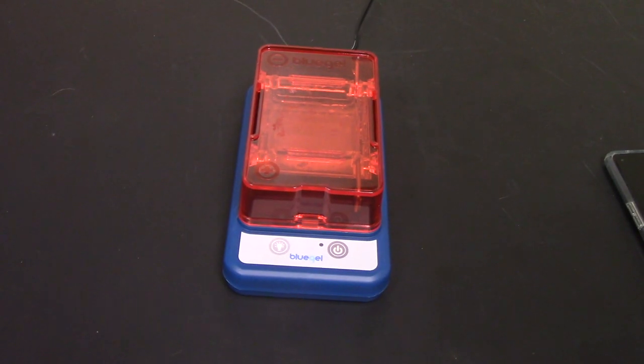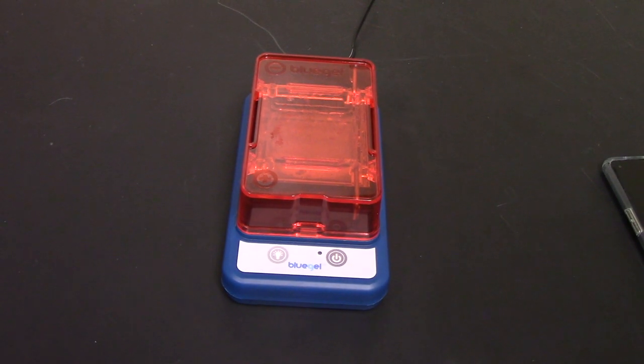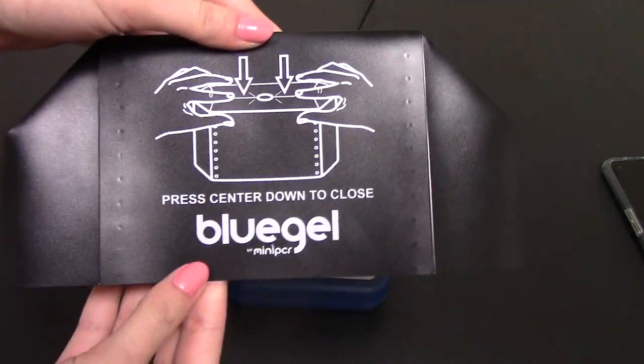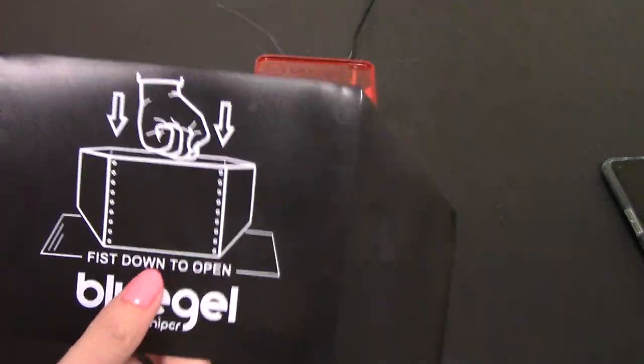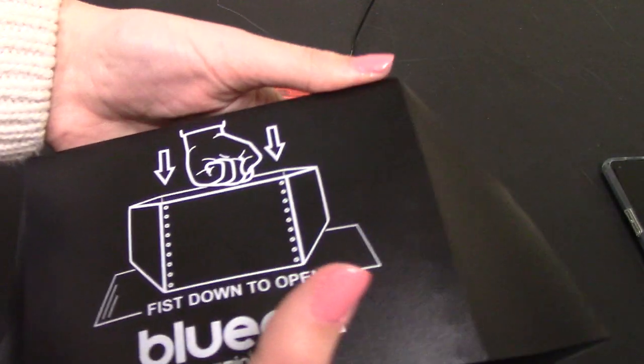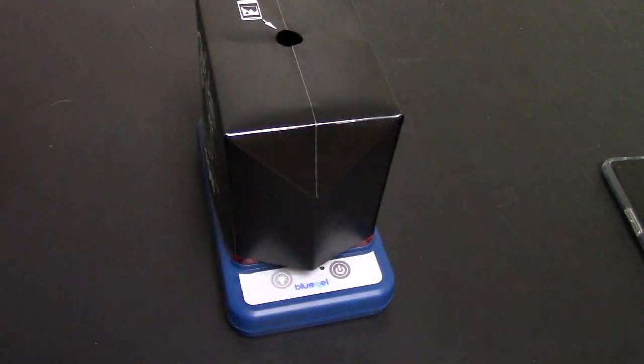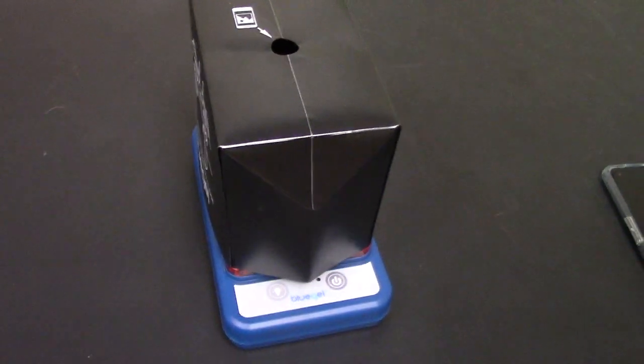My gel is all done running and what I'm going to do to view the gel is use this sort of tent to look at the gel. I'm going to fold it open and put it on top of the gel like that, and now I'm going to take a look at my gel.